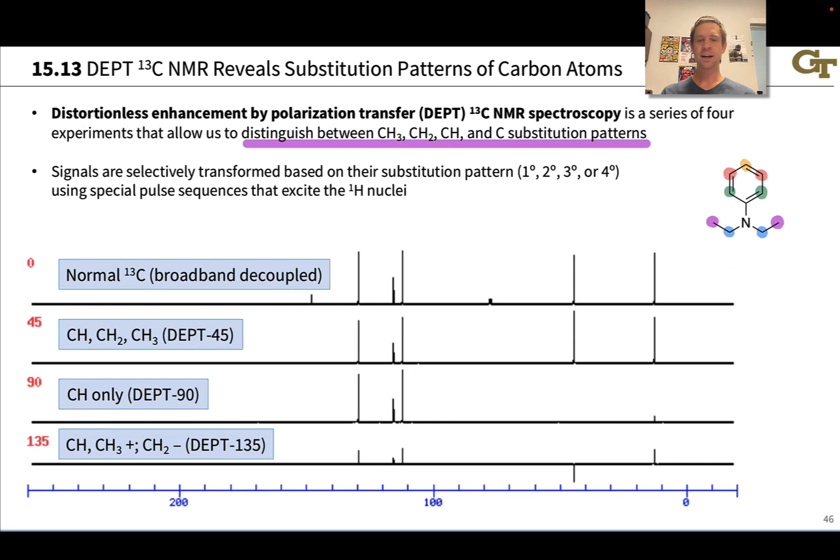The zero degree is just our plain vanilla carbon-13 NMR spectrum. I think it's helpful to start with the 90-degree spectrum, which immediately tells us which signals correspond to CH, only one hydrogen connected to the carbon. It's these three: the red, orange, and green. The important point is these are the three CH carbons in the benzene ring of the compound.